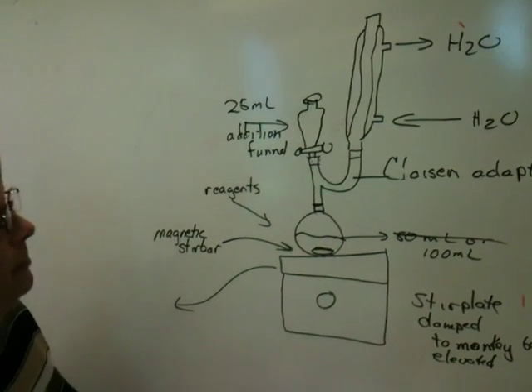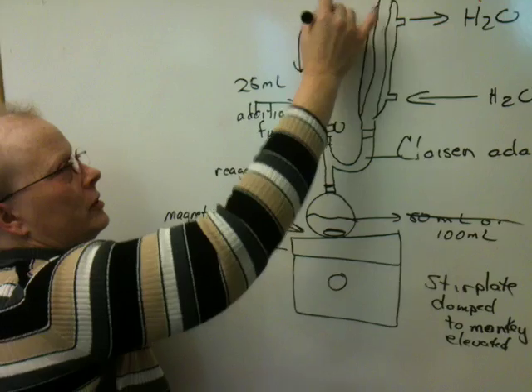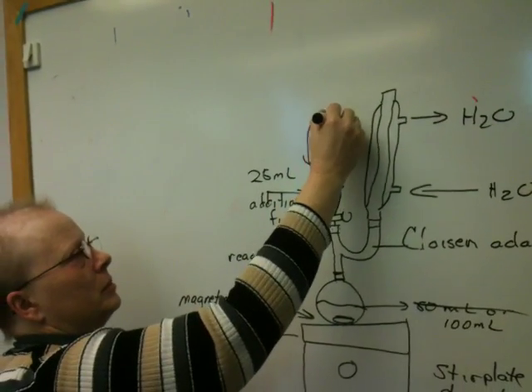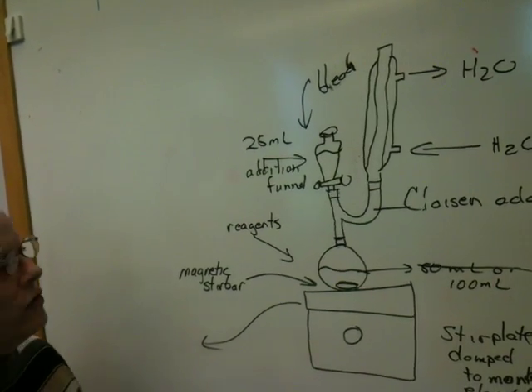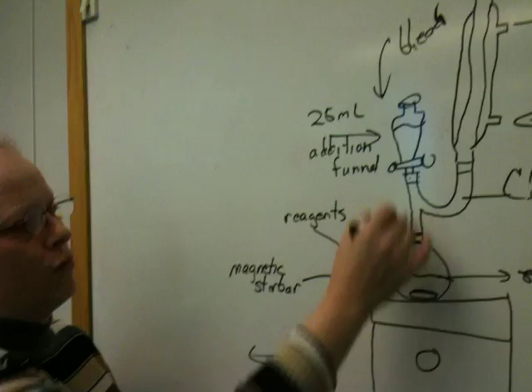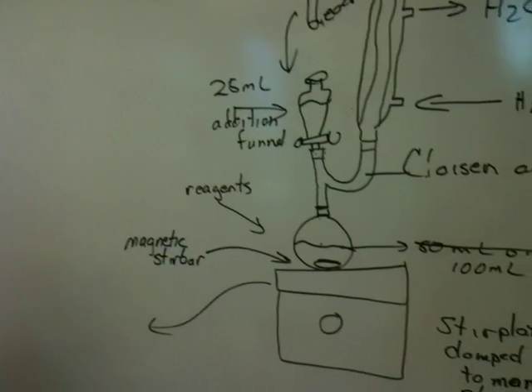I also call it the pear-shaped adapter. Now, up here, this is where the bleach goes. So the bleach is going to go up there. When you start the reaction, the reagents will be down here. And when you start the reaction, you're going to run in some of this bleach. And we'll help you with that.